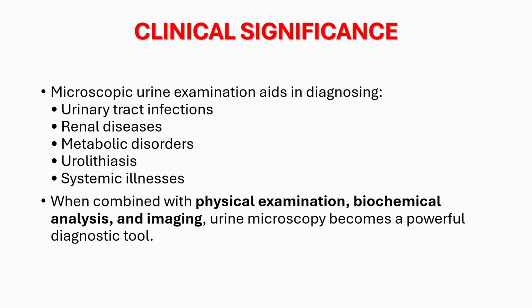Microscopic examination of urine is an essential skill in veterinary diagnostics. A systematic approach, proper sample handling, and correct interpretation ensure accurate diagnosis and better patient outcomes.